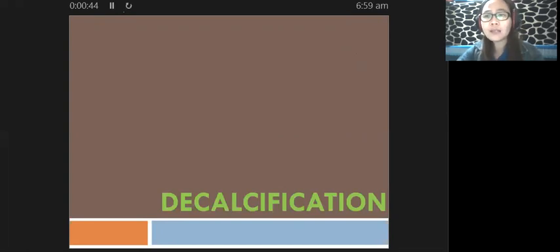Okay, so first, just like I have mentioned, what is the definition of the word decalcification? Just like what I always emphasize, not just in histopath but also in my other classes, like for example in HEMA 1, when you are going to determine the definition of a particular term, you just have to look at the term itself. If we look at the term decalcification, there is the prefix D or de. We all know that the prefix de means to remove. And in this case, what are we trying to remove? We are trying to remove the calcifications or the calcium salts which are present in your tissue samples.